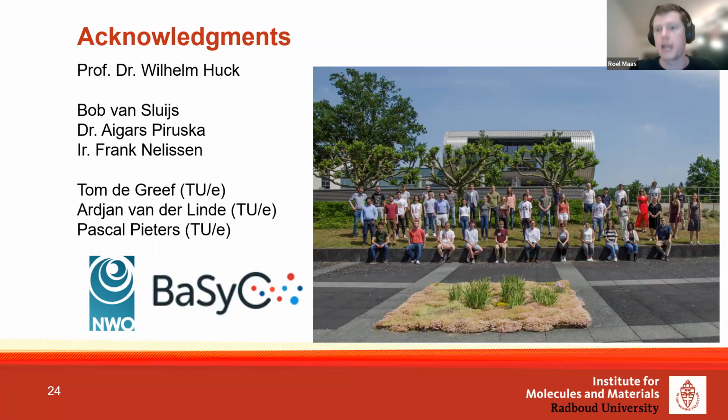Also, optogenetics would be an option because it's already on the microscope. So you could just shine light with a specific laser and activate transcription and activate repression or activation at specific time zones. That would also be really interesting. So then you have another control parameter than just inflow of DNA. You can also first flow in DNA and then activate repression using light, for example. That's also very interesting.